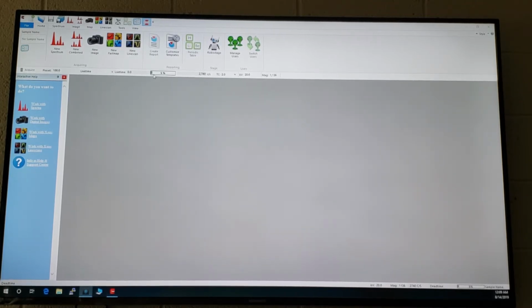Where if this was a liquid nitrogen detector, like the detector you have on the other SEM, at around 1,000 or 1,500 counts a second, this percentage of dead time will be around 30%. Why did we stop at 50? Well, because at 50%, you're not processing 50% of your information. So 50% is dead. The detector at that point is like, hang on a second, I'm trying to determine what this thing is. You're giving me more information, I can't handle it. It's getting a lot of pileup. It's getting 10, 20, 30, 40, 50% pileup. That's what it's doing.